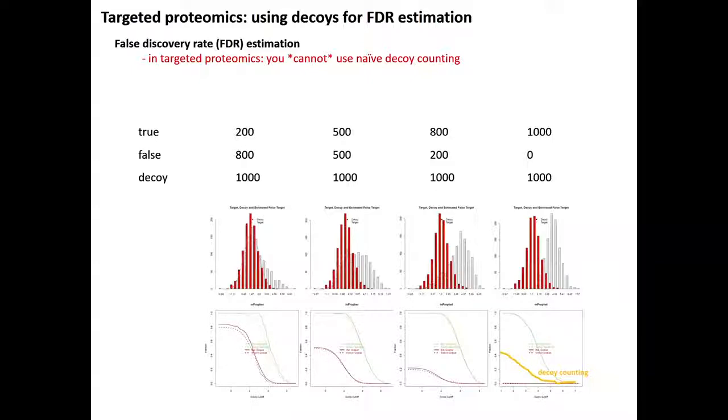So the biggest difference that we find, and this is also something that I think Mike's group has implemented, is that we also like local decoys, which change very much the way the targets are scored. This is something that underlies PeakView. So it's not so much the linear or non-linear or whatever combinations you do on the scores. It's rather the way you treat the decoys versus the targets that, in our hands at least, seems to have changed how much data you can extract.